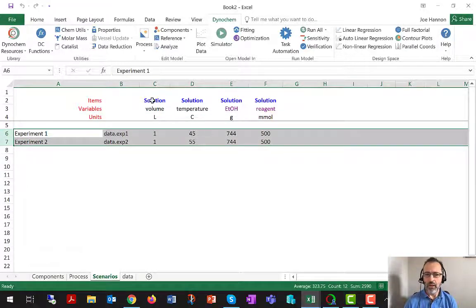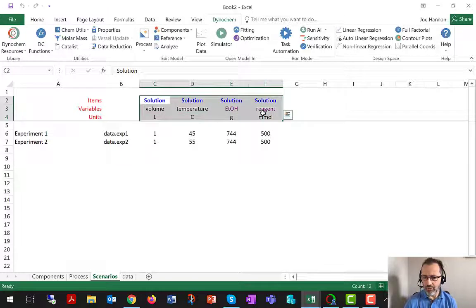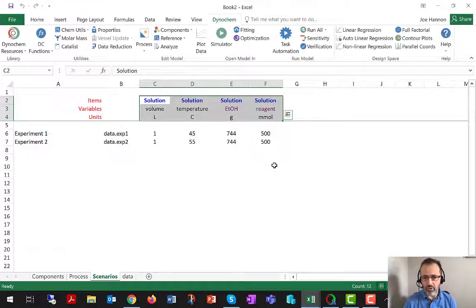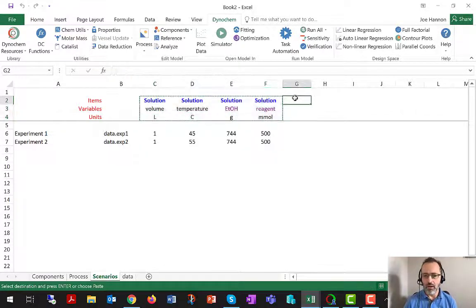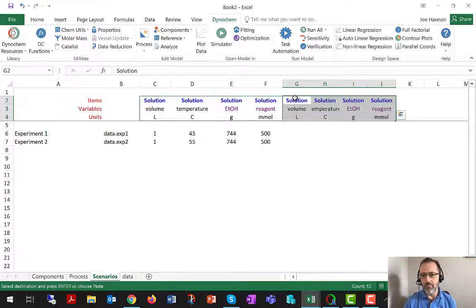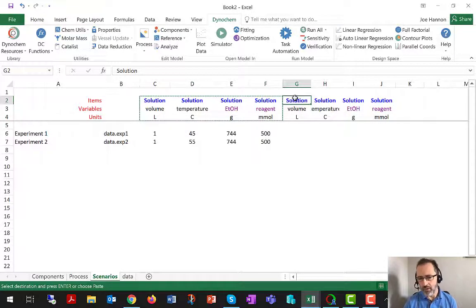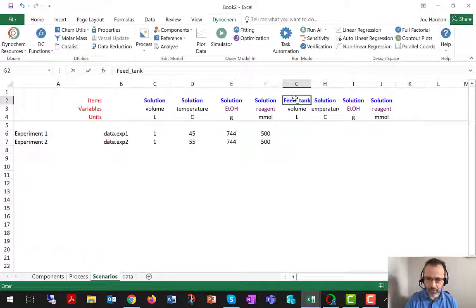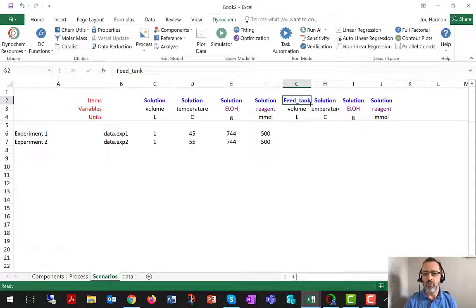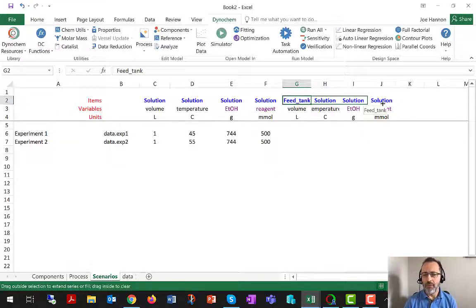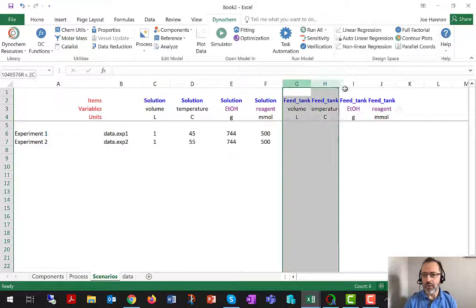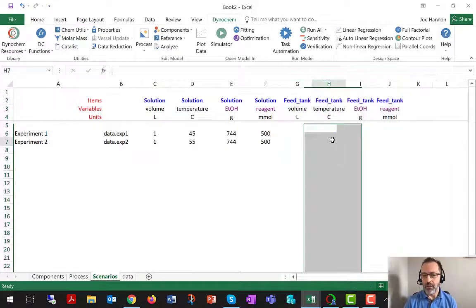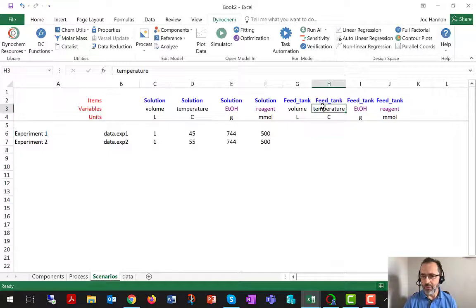I'm going to use copy and paste here to just make myself some extra column headers, which are going to define the contents of the feed tank. And I'm going to just drag, using normal Excel functionality, to get the word feed tank in this group of cells to the right.